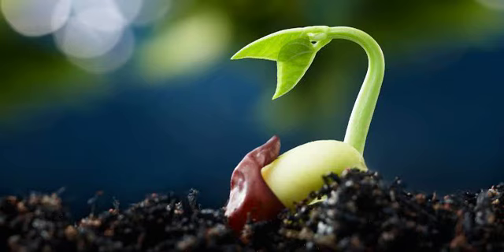One cotyledon in monocotyledon seedlings and two cotyledons in dicotyledon seedlings. Seedlings with slight defects are normal provided they show vigorous and balanced development of the other essential structures. Seedlings with secondary infection.